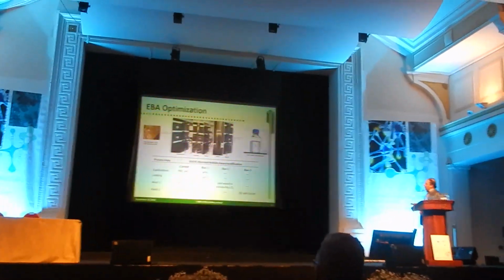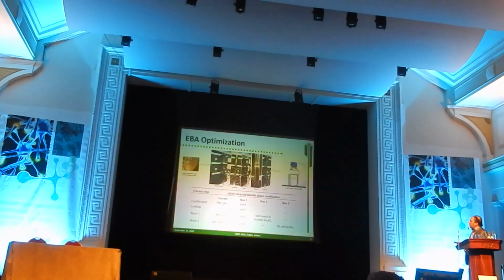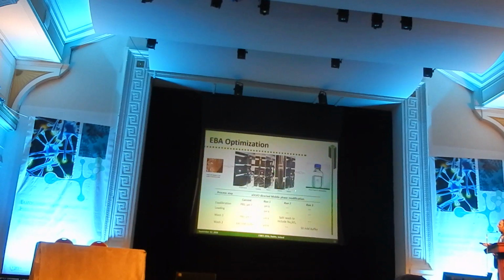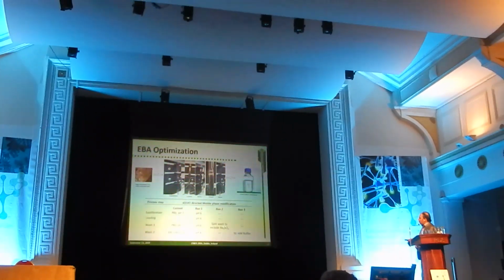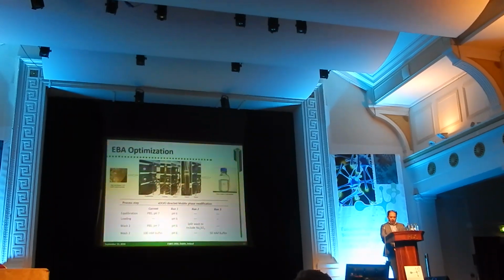This is the capture of the protein A capture of the monomer antibody. This is the current protocol here. We suggested three lines of kind of improvement or potential improvement, and modifying the pH or adding salts or changing the ionic strength in these cases, as you see here.